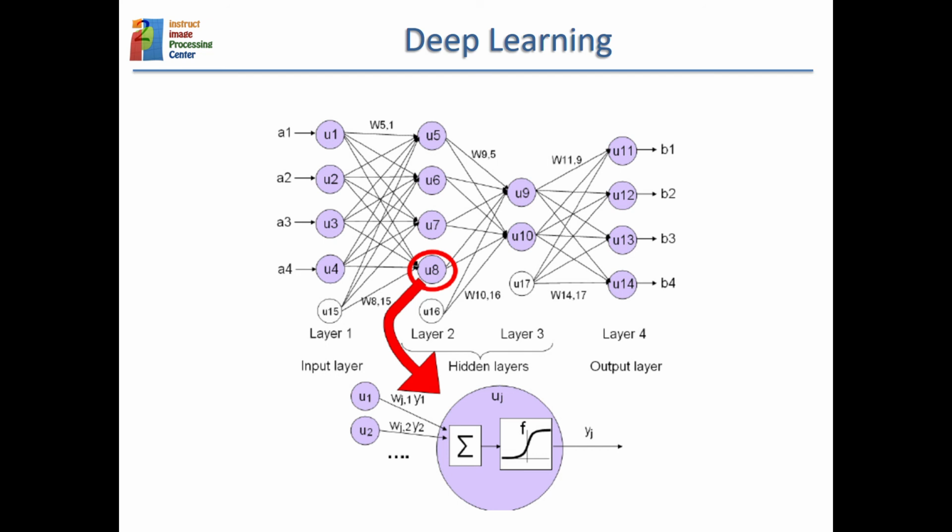GPU stands for graphical processor unit. And the final thing, which is very important, is that you are able to estimate the weights between the connections of the different neurons. These weights are parameters that you have to optimize and find for making this regression.